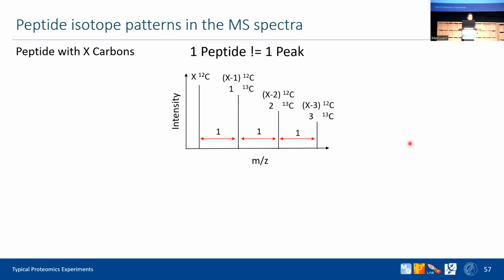So since we know each peak where it corresponds to, we know what the distance between the consecutive peaks should be. If we measure the distance between 2 consecutive peaks of an isotope pattern to equal 1, which is what I expect the mass difference to be, then that means I can get information for the charge.